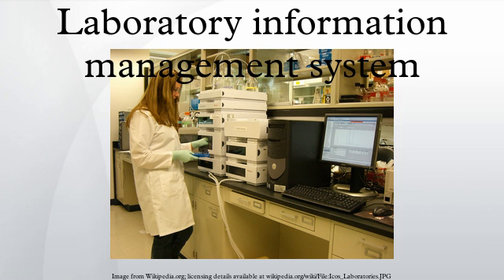The features and uses of a LIMS have evolved over the years from simple sample tracking to an enterprise resource planning tool that manages multiple aspects of laboratory informatics. The definition of a LIMS is somewhat controversial. LIMSs are dynamic because the modern laboratory's requirements are rapidly evolving and needs often vary significantly from lab to lab. Therefore, a working definition of LIMS ultimately depends on the interpretation by the individuals or groups involved.